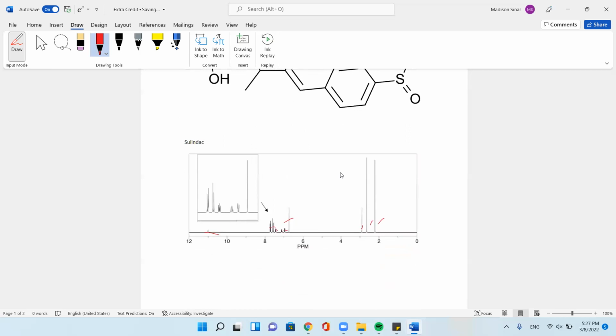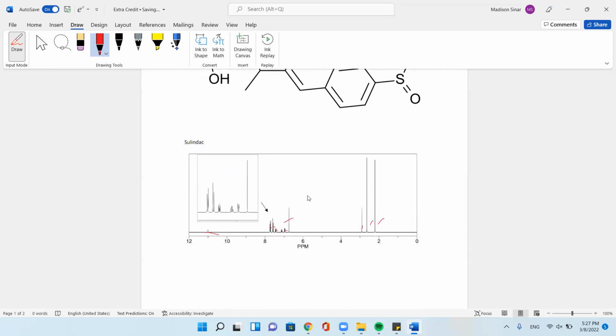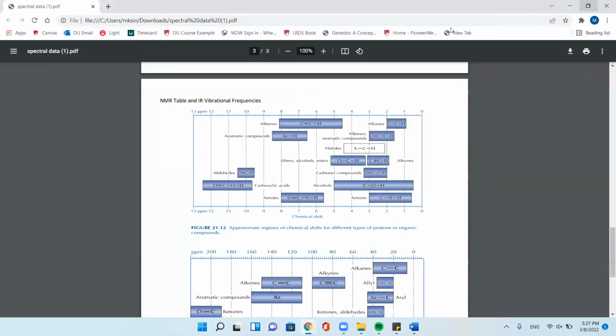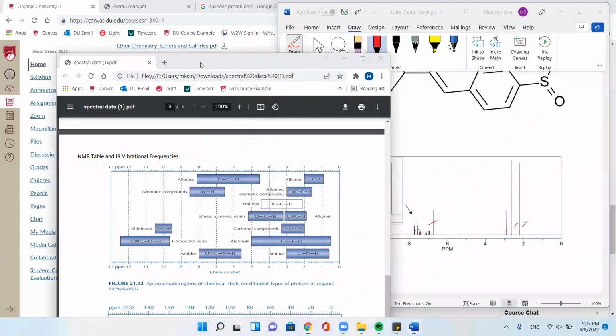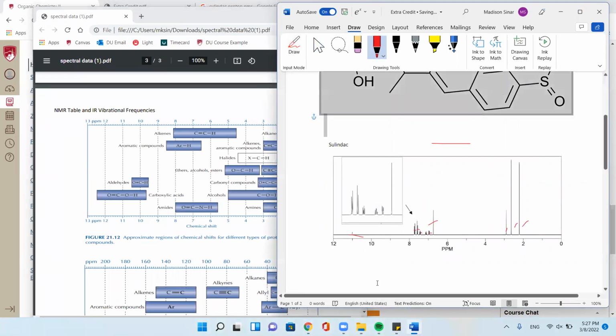This does not give us the number of hydrogens, just simply the number of identical groups of them. So that does give us some information. However, in one like this, I do like to go to the position, just because we can get a little bit more information. Let's pull up our spectra data and put these side by side so we can actually see. Probably make life just a little bit easier.